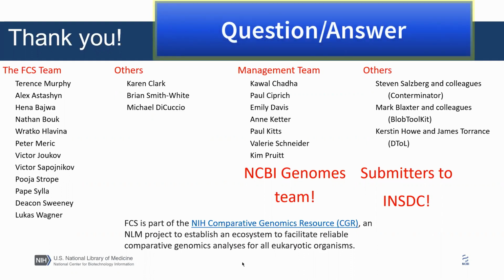Thanks very much, Eric. So we have some questions. One of them is: instead of removing the contaminants from assemblies, isn't it easier to remove the contaminants from the reads? And I suppose part of the answer to this is that we're talking about things that are already assembled that we're going to submit. Do people find, even after they remove stuff from the reads, that they're still in the assembly?